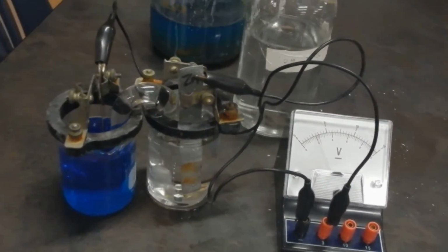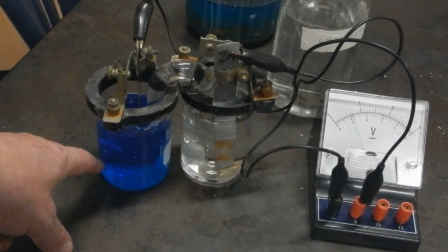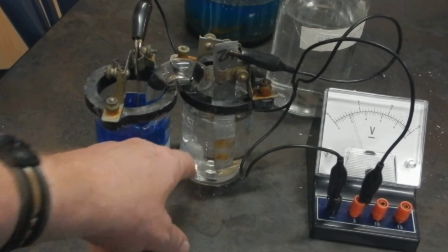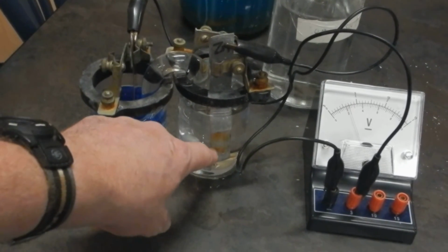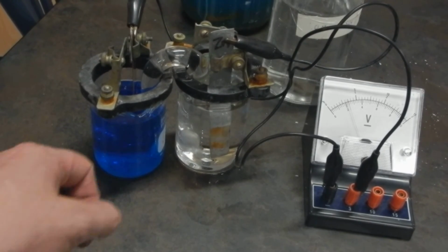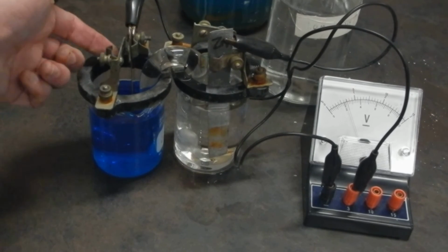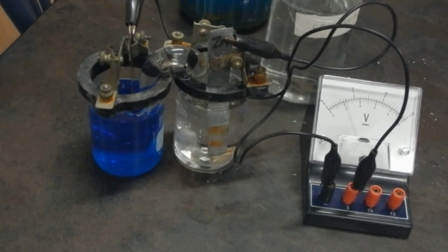But what we've got is we've got a copper half cell here, so we have copper and copper ions, and we have zinc and zinc ions in solution. And this zinc electrode is going to get lighter because the zinc is going to be oxidized into zinc ions, and here copper is going to be reduced. So we're going to actually add copper to our copper electrode.